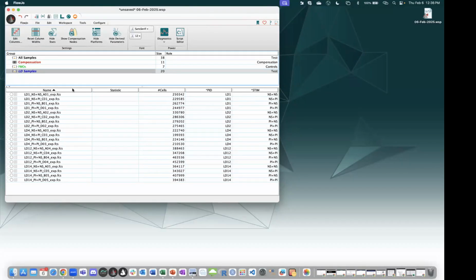So now we want to do the analysis, now that the annotation is done. We're just gonna double click on any sample name. By the way, I don't need to do the compensation. The compensation was done on the instrument. You see that my square here has a grid telling me that the compensation was done. If I put my mouse over, it says the compensation matrix is acquisition defined, so it has been done on the instrument.